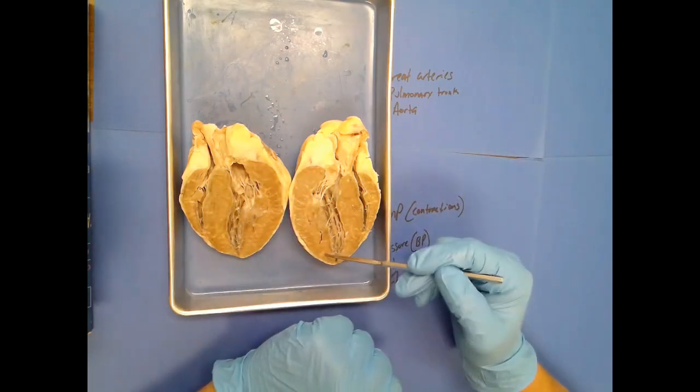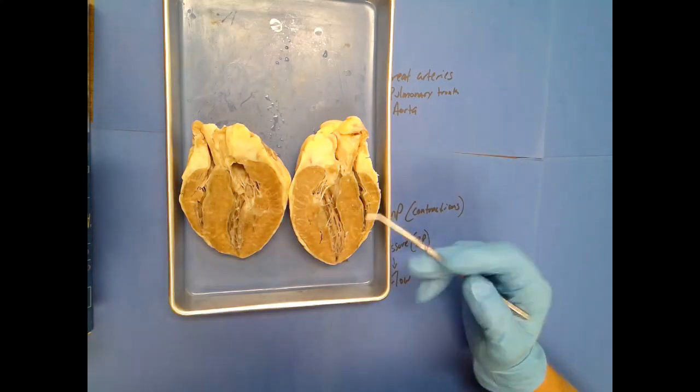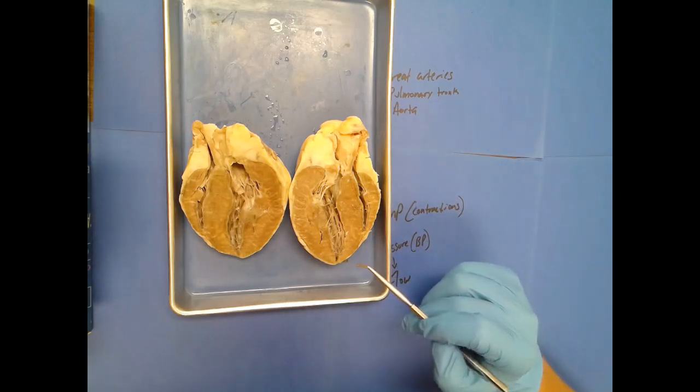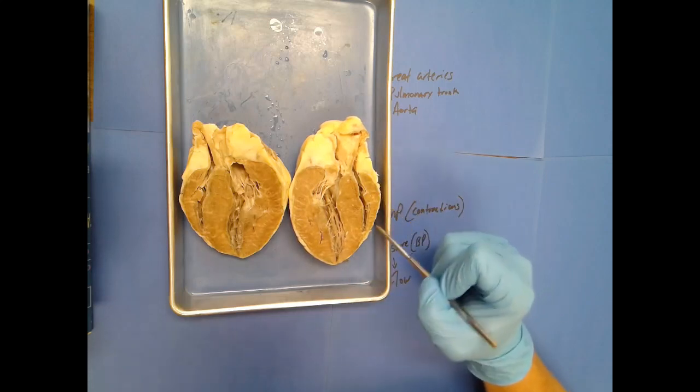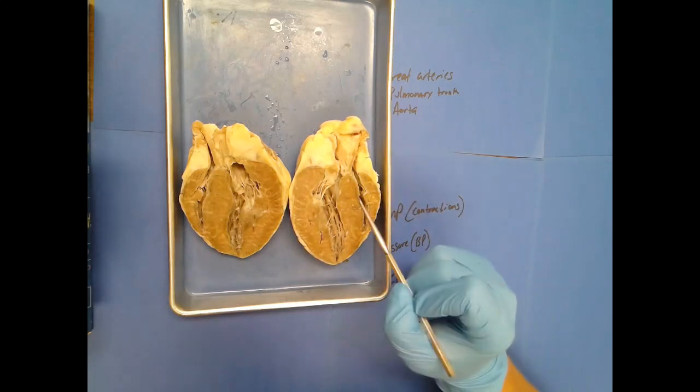All right. So the thicker side is the left side. The thinner side is the right side. Always start there. I can't emphasize enough the importance of that. Always start there. Thick side, left side, thin side, right side. Simple as that. And then in the middle, we've got the interventricular septum.